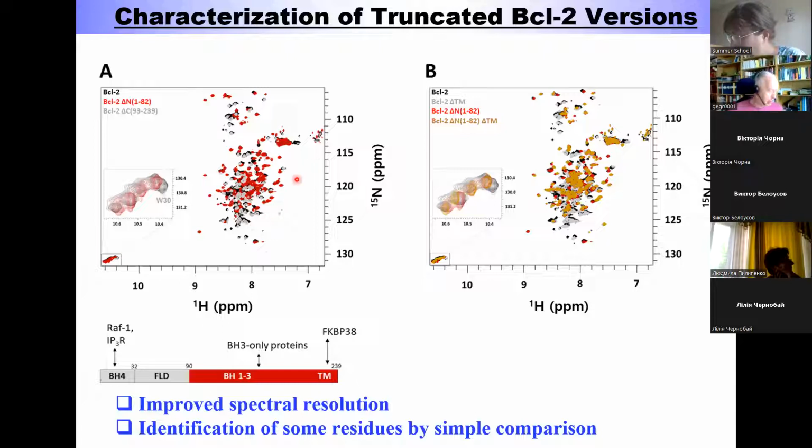This is quite nice, because you can determine the structure of smaller parts of the protein, put them together, and you get more or less the structure of the whole protein. So they're not unfolding. It's also shown here. The only thing is the loops, which look a little different. But then really, by making different parts of the protein, you can look at what the different domains are doing. We are working on it.